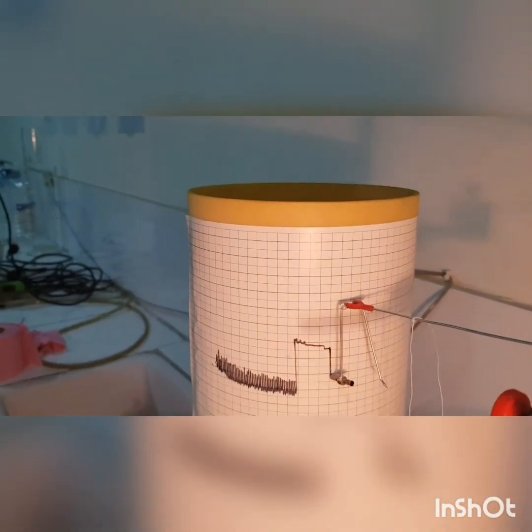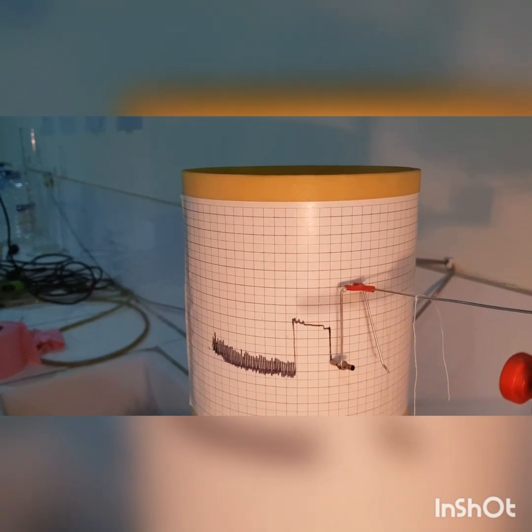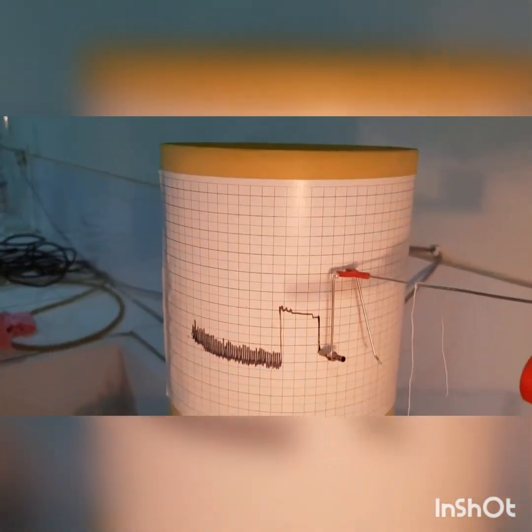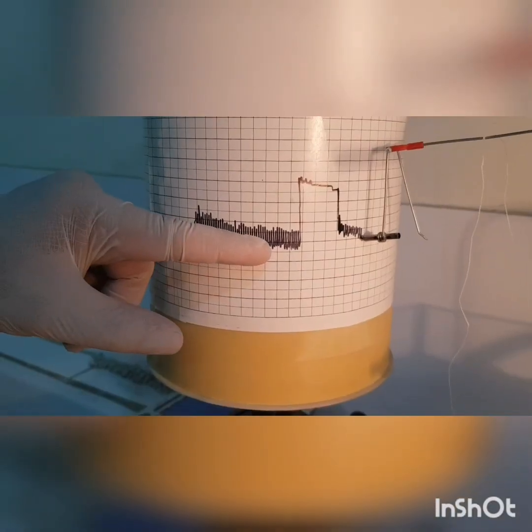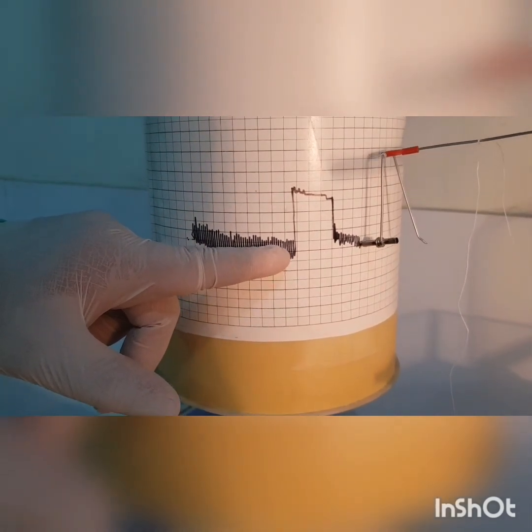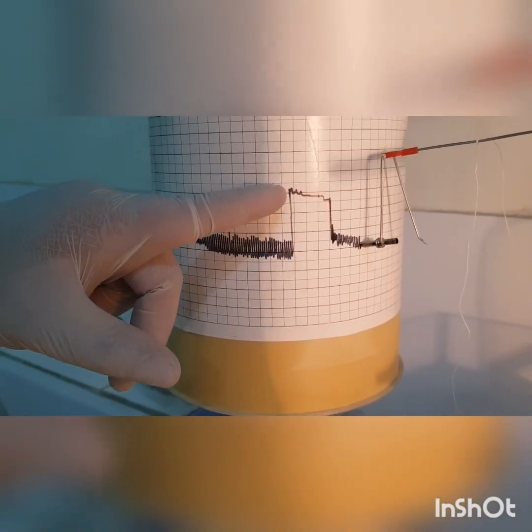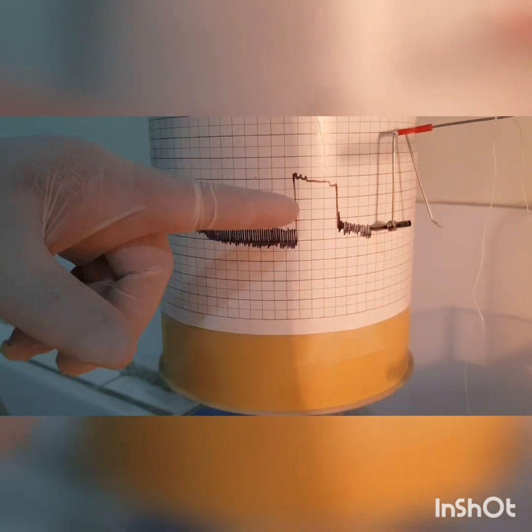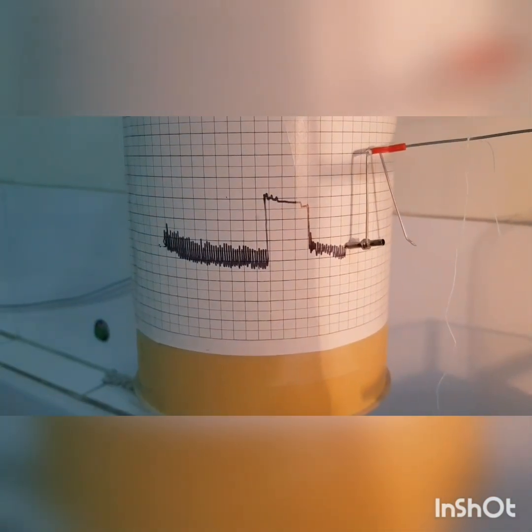After washing out the drug, again there will be normal contraction. This is the normal contraction, 0.2 ml of acetylcholine agonist, which produces 50% of maximum response, and then we wash out the drug and this is the normal contraction.